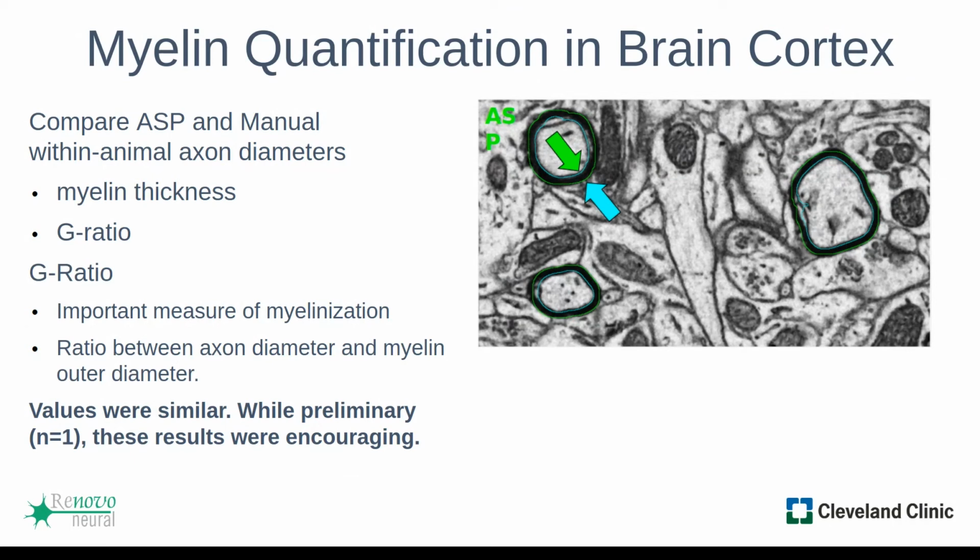Another question was, will the specimen preparation methods and protocols work for FIB-SEM? Yeah, because the same staining procedure is used for both ways of doing serial block face. People use the same type of protocol for FIB versus diamond knife cutting. So yes, the same should work.